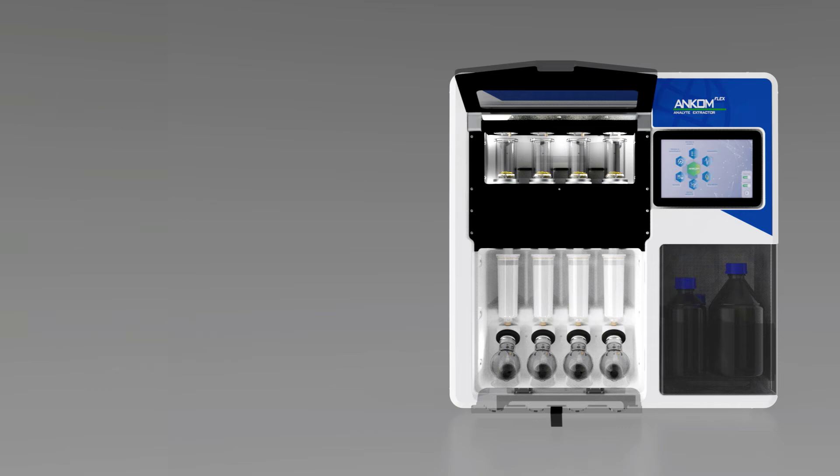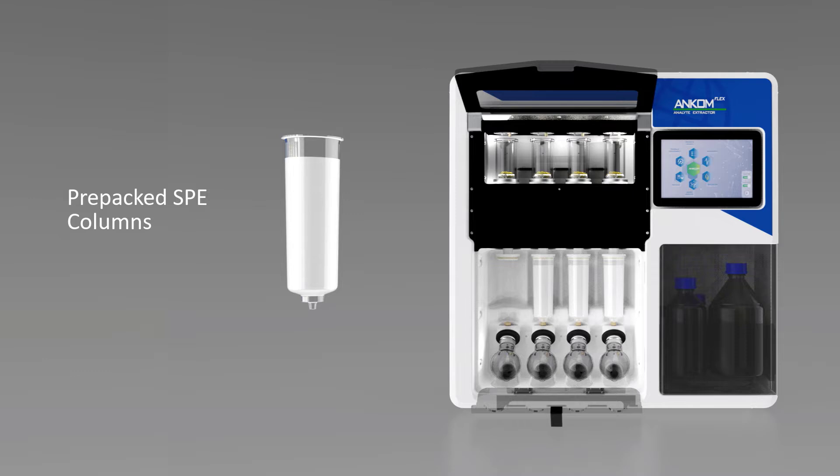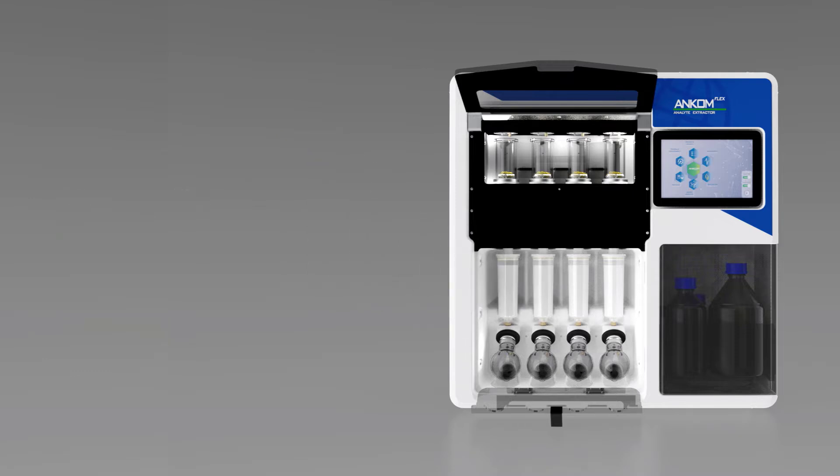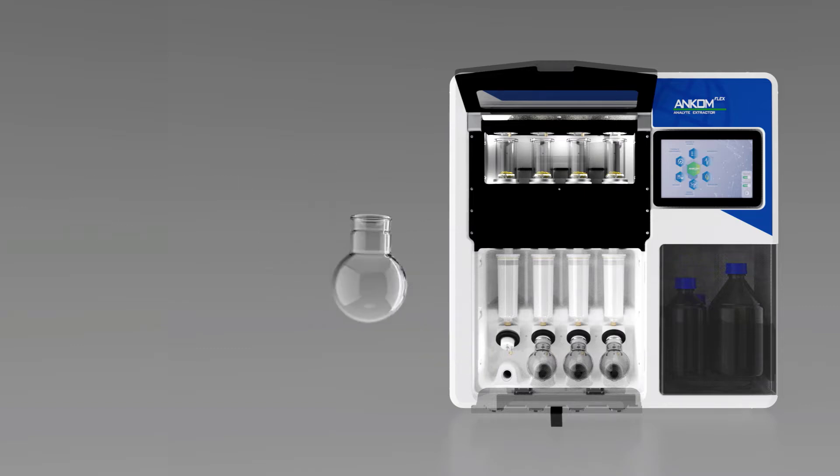This setup includes the installation of pre-packed SPE columns to support the extraction step. Specially designed glass globes eliminate the need for separate roto-evaporators.